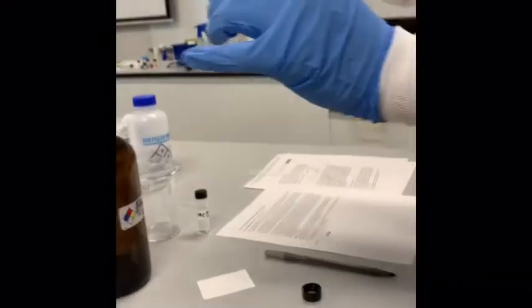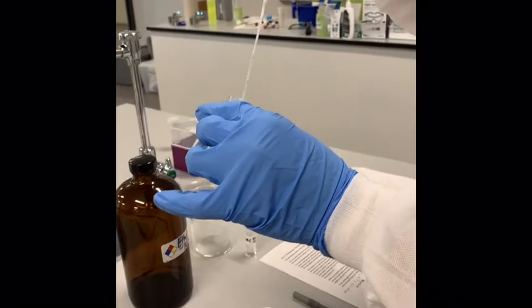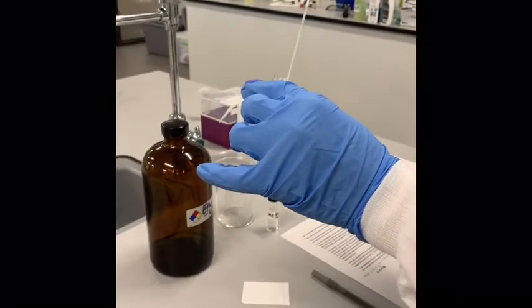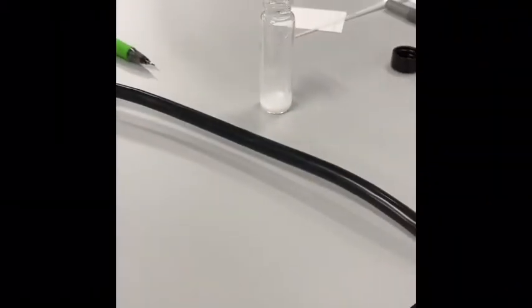Do you see any white cloudiness when you do that? Yeah. So the product crashed out. We have that nice white product. Now we're going to add a few drops of ethyl acetate — it should dissolve our organic material that has crashed out. Add about this amount of ethyl acetate, and that should dissolve all of that product so we can spot it on our TLC plate.